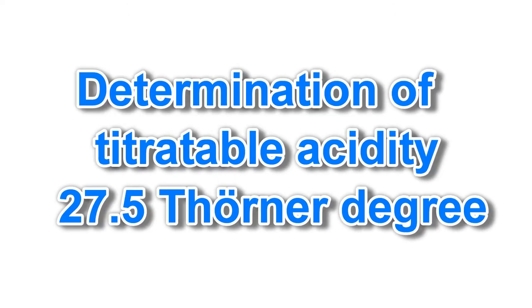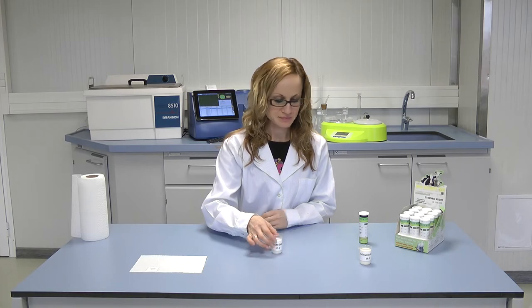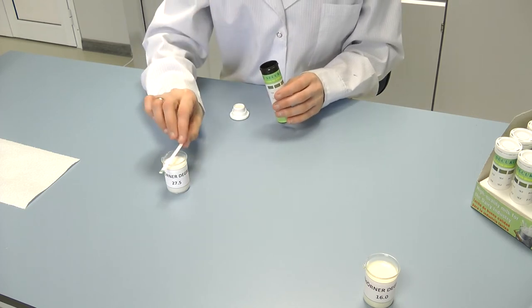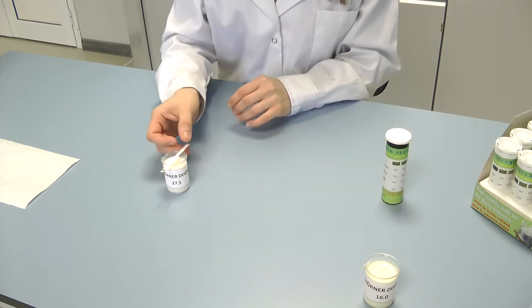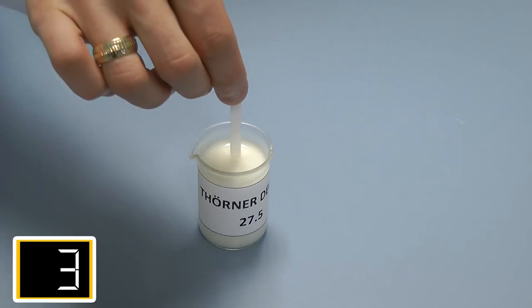First, test milk with a titratable acidity of 27.5 TH. To do this, first open the cap of the test tube. Take one test strip for testing, then immediately close the tube. Dip the indicator zone of the test strip in the milk sample.